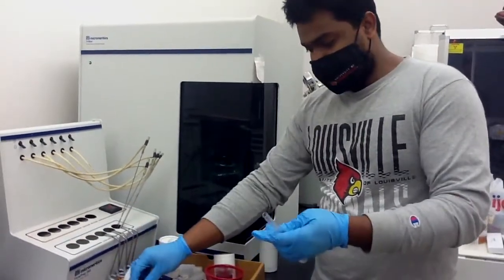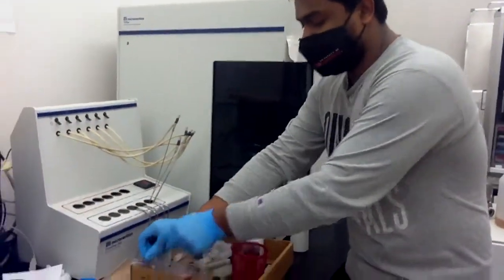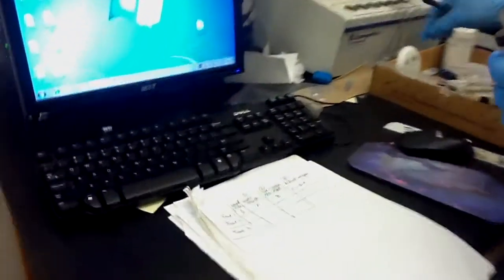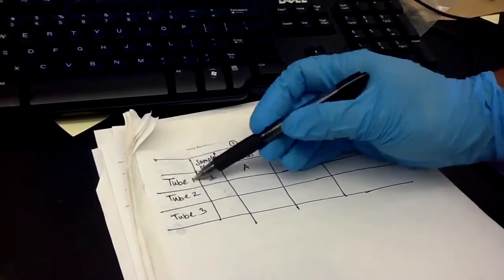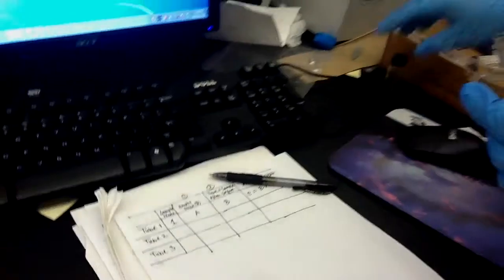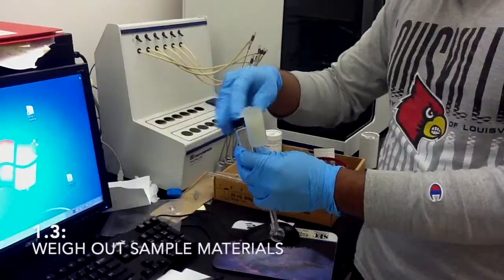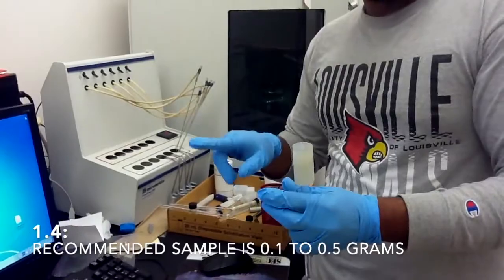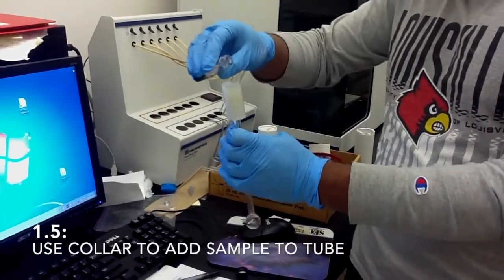You need to put your sample inside this tube. To do that, you will use a balance and make a sheet like that. Suppose here we can use three different tubes: tube 1, tube 2 and tube 3. Suppose I will use tube 1. All you have to do at first is measure the empty tube on the balance. Then you need to measure the weight of the material. The recommended weight is 0.1 to 0.5 gram. After measuring the material, you can put your material here.